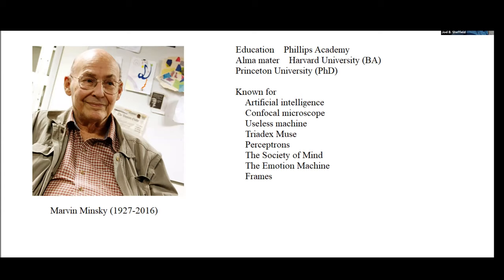And there's a wonderful essay he wrote, which I'll post for you to read, in which he talks about how, because he was interested in the brain, he wanted to see if he could get images that would be less blurred, less confused. So he thought about this same issue that I just described, of the confusion caused by extra material. And so he thought the thing to do is make a spot, get the spot to go through the sample in some way, and then collect the information. Now, this is in 1955. There was a lot of equipment that he didn't have, equipment that we today would have very easily.